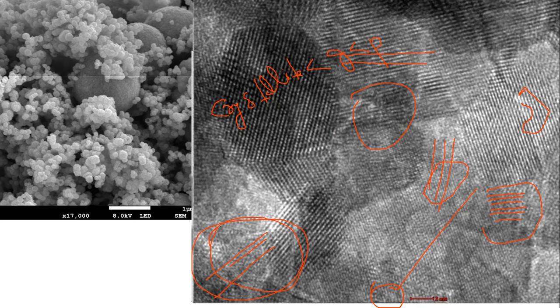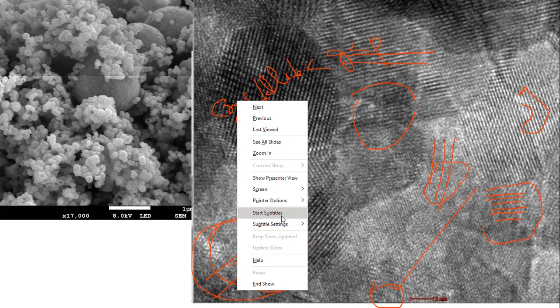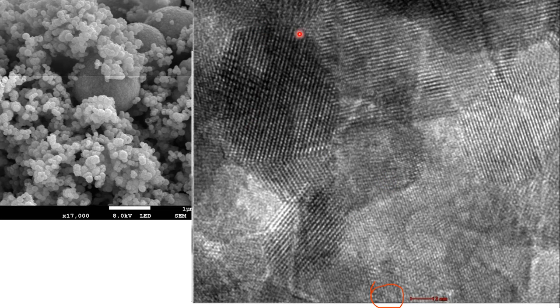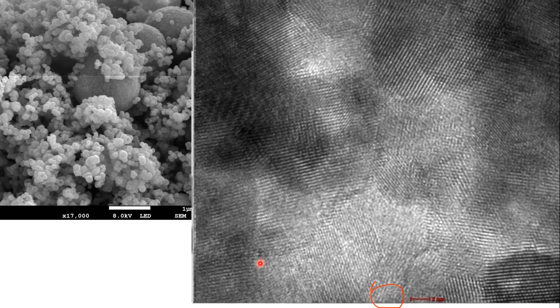This shows that the material is polycrystalline in nature. Looking at the grains, they are oriented in different directions — the planes in this grain are vertical, while other grains have planes oriented differently. Each grain has its own plane orientation, which is why this material is polycrystalline.